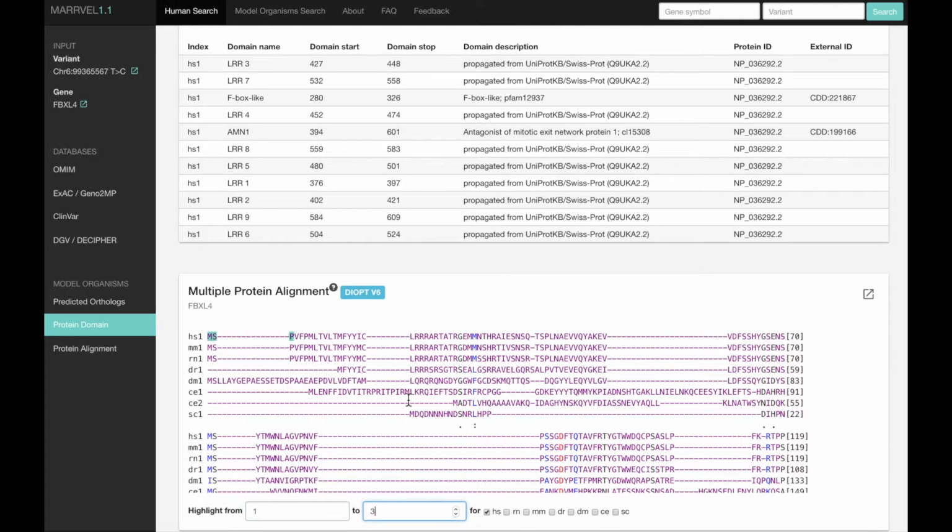We are currently developing features to convert the genomic variant information into protein variant information, but until this feature is installed, please manually find the amino acid of interest using these fields. If the amino acid that you highlight based on the number is not the one you were expecting, you may be using a different splicing isoform.